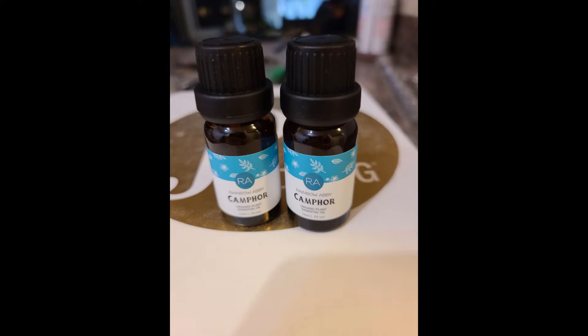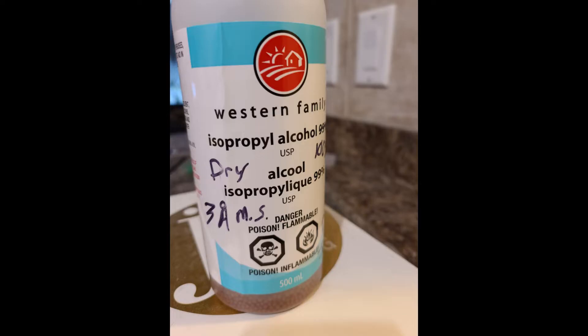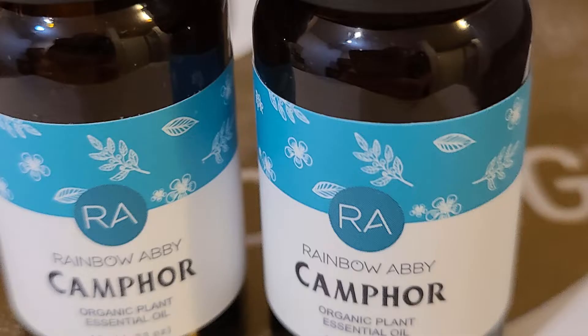Alright, enough geek chatter, let's do a reaction. I got some overpriced camphor oil from Safeway and used the aluminum isopropoxide and dry isopropyl alcohol from the last video. The exact quantities do not matter much, as the alcohol is in great molar excess and the aluminum isopropoxide is a catalyst. The camphor is the limiting reagent and I used the two small bottles.